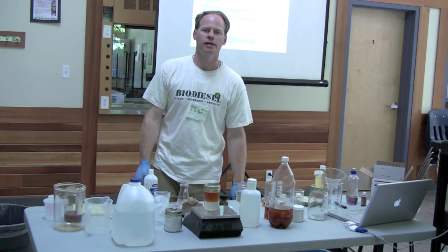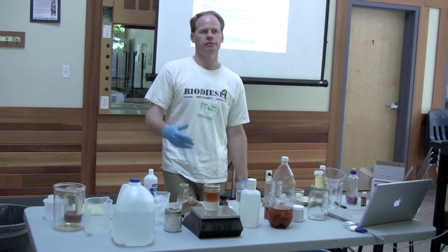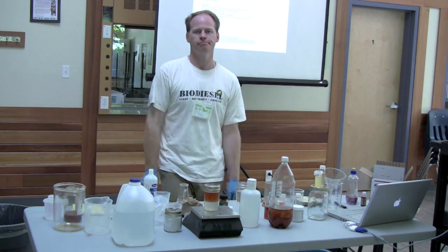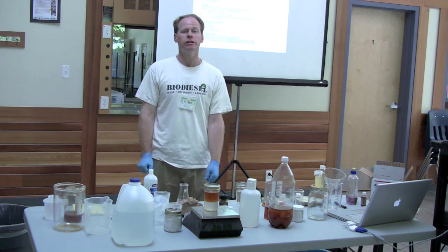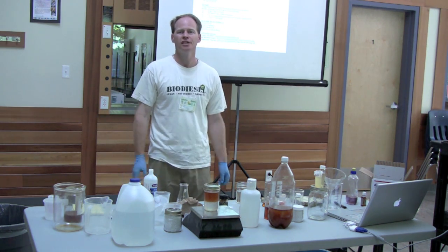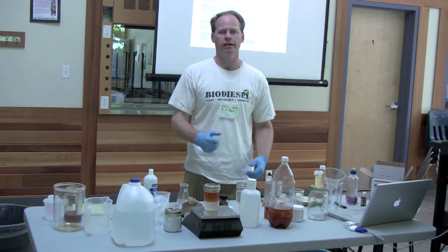Could you, if you suspect your catalyst is wet, put it in an oven and dry it off? No. Once it's wet, it's reacted with the air, it's toast. Okay, got to get new catalyst. Another rule of thumb: if your catalyst is over a year old, even if you think it's been sealed, go get another bag. It's cheap enough. So we battled that one once.